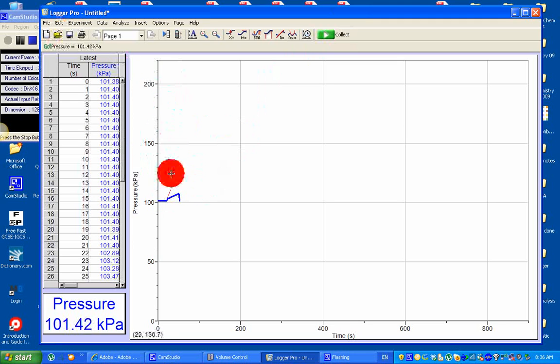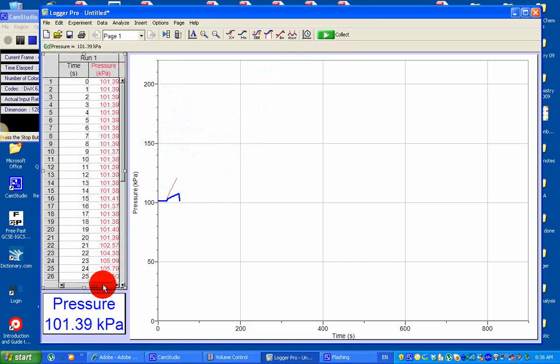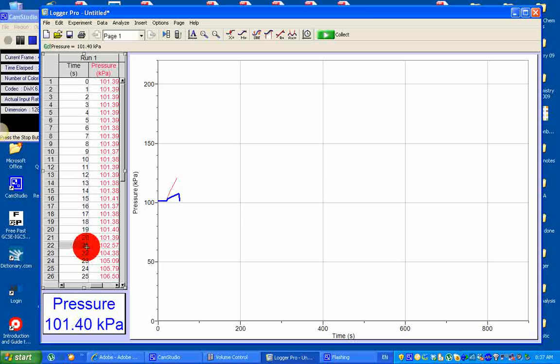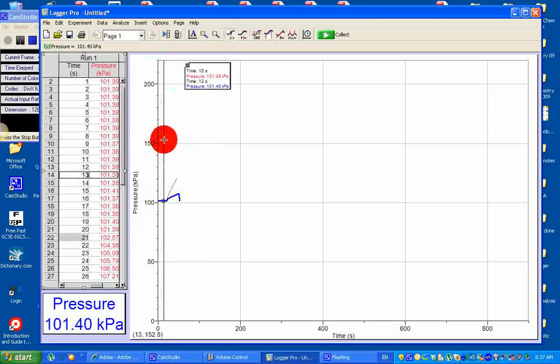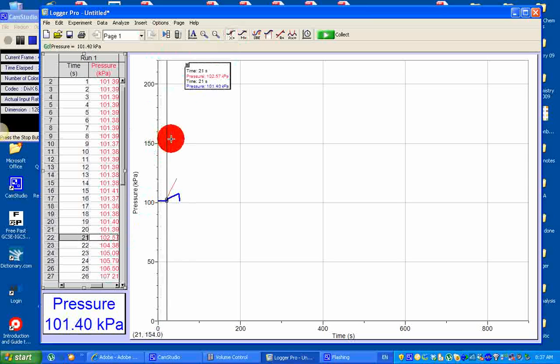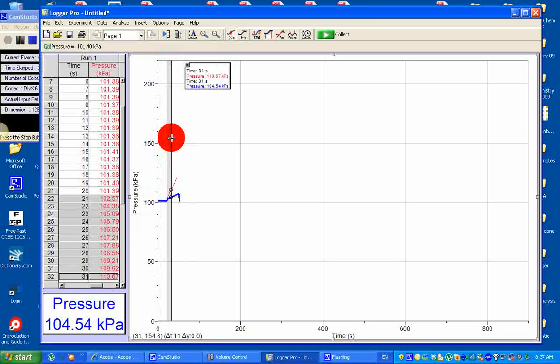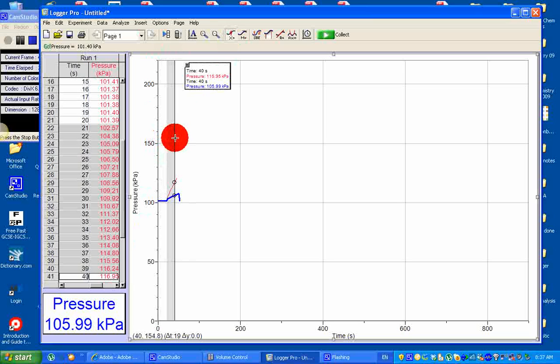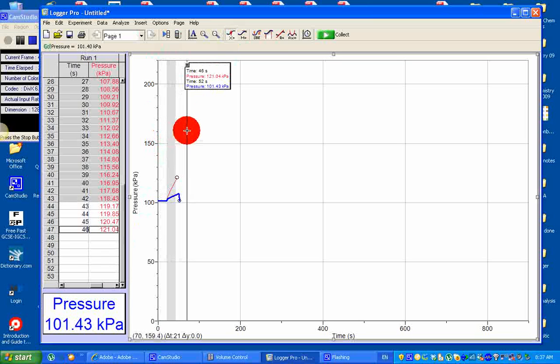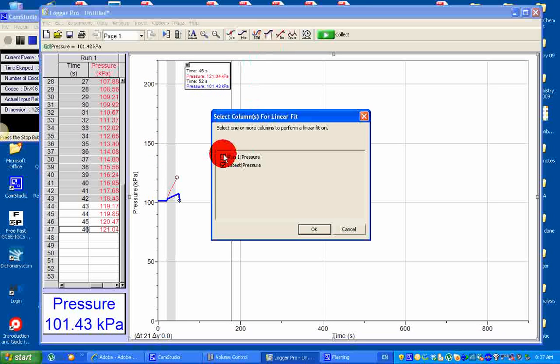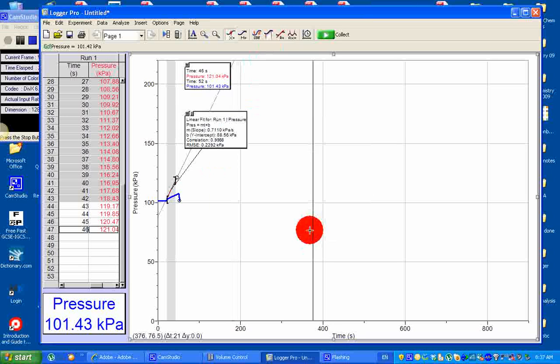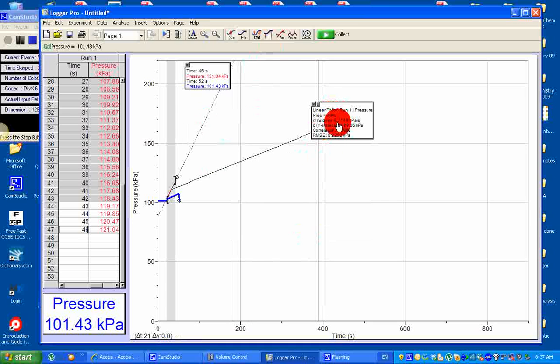Get back to my first data. This is 101 — the reaction starts at 21 seconds. Click on this button. Measure it for the first 20 seconds, which is up to 41 seconds. Look for the gradient, the steepness. Click on run 1, press OK. The slope is 0.7 — that is the rate of reaction for my first run.